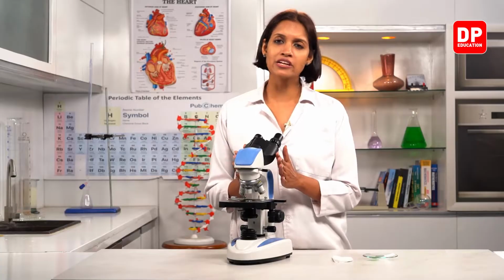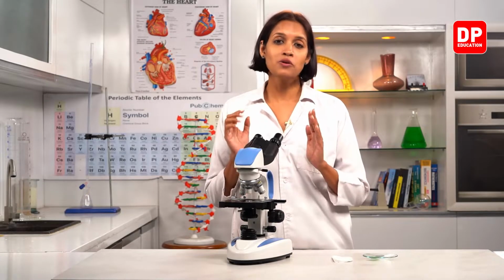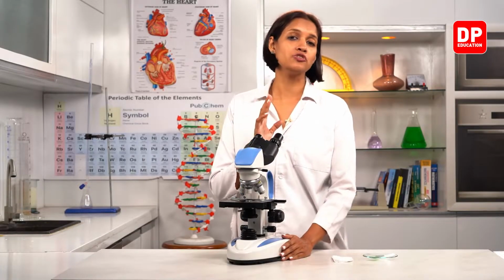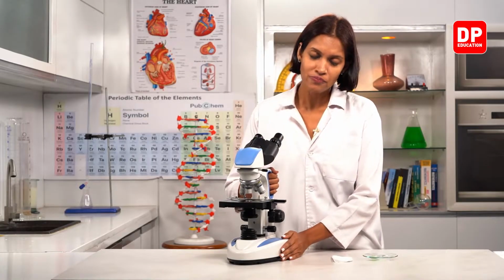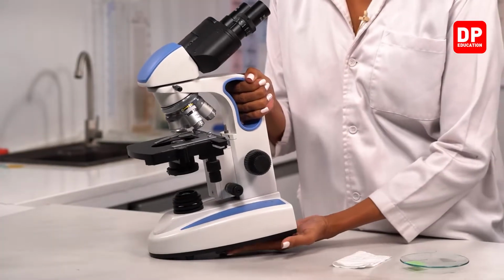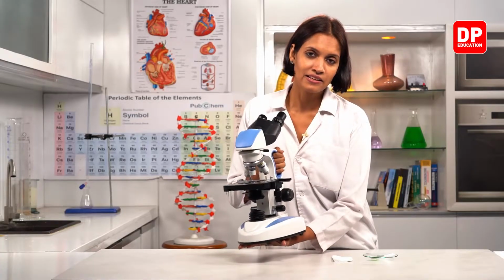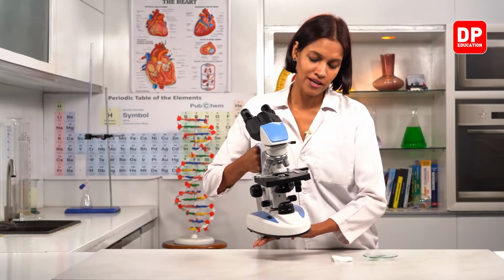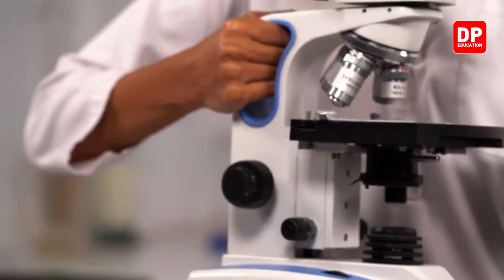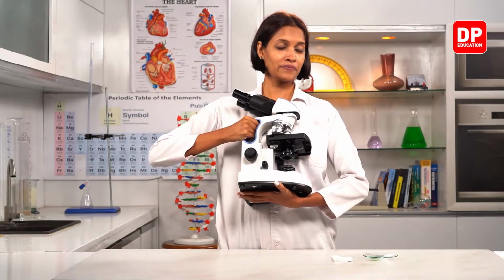Now, when we carry the microscope from one place to another, we should make sure both hands are used, okay? The dominant hand should always be used to hold the handle, and then we have to keep the other hand under the base, like this, right? When we take it from one place to another, slowly place it like this, and keep it closer to your body, towards your body, right?